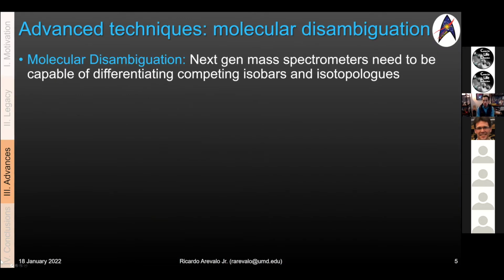But this is a problem that we have faced and will continue to face in the coming decades: separating out and trying to elucidate as much information as we can from that mass spectrum. Again, it's not new. Even in addition to trying to reconstruct the spectra, we get other groups.